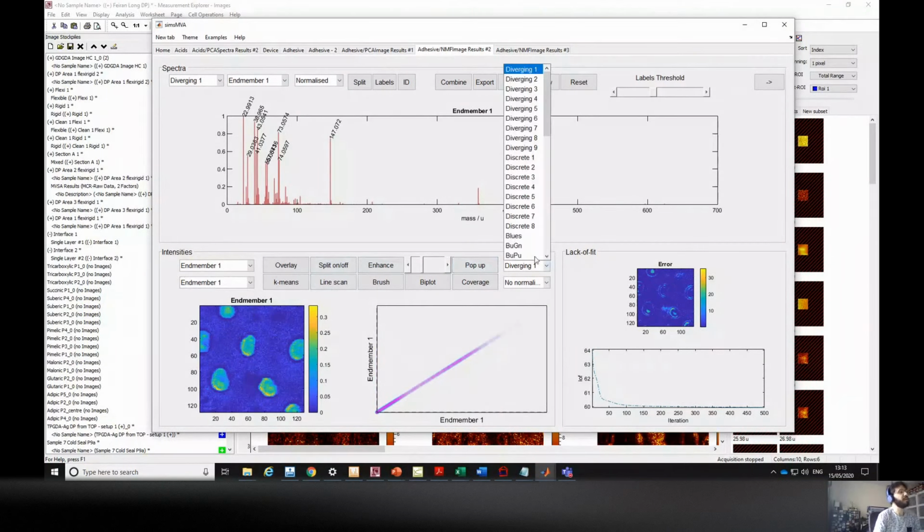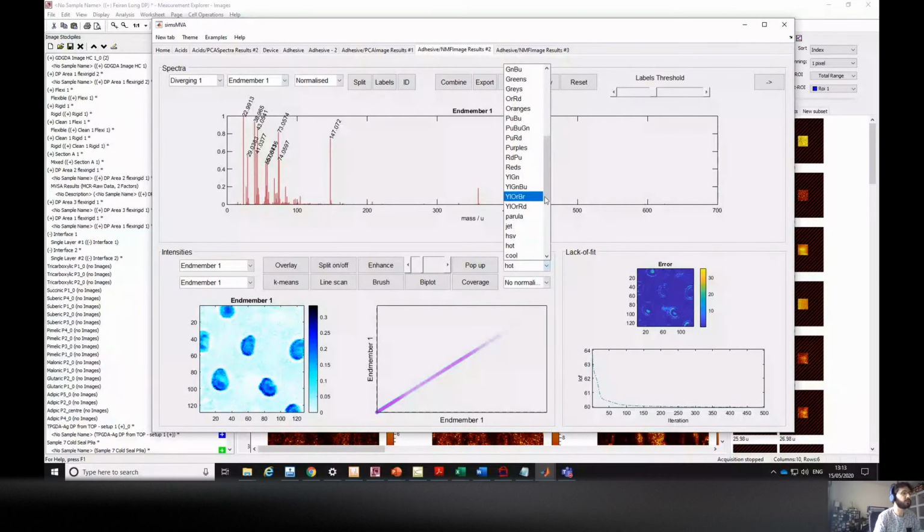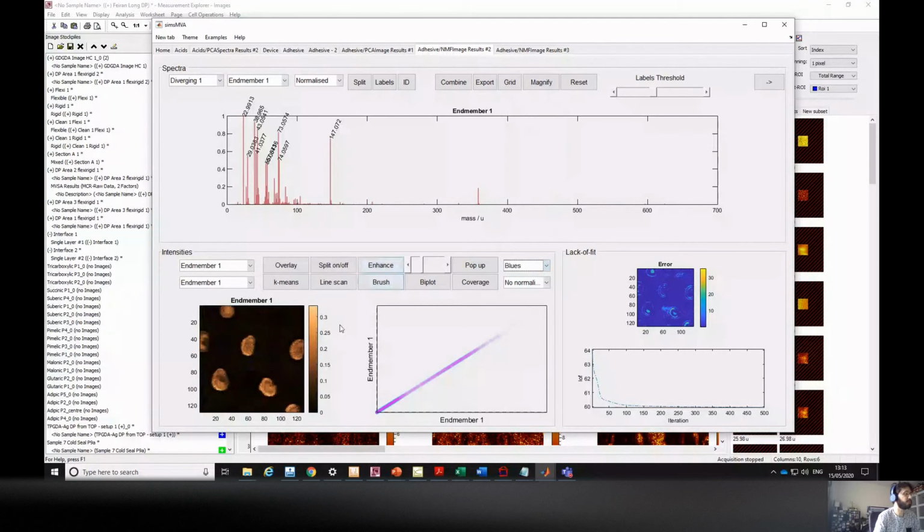Again, with PCA, we're picking diverging color maps, but now because we have only things going from 0 to something, it doesn't make sense to pick divergence. Actually, it doesn't look good at all. Some of them will do, but it will not help you with your interpretation. So we can use something like this hot, or like last time the blues that will look orange, or yeah, brown.